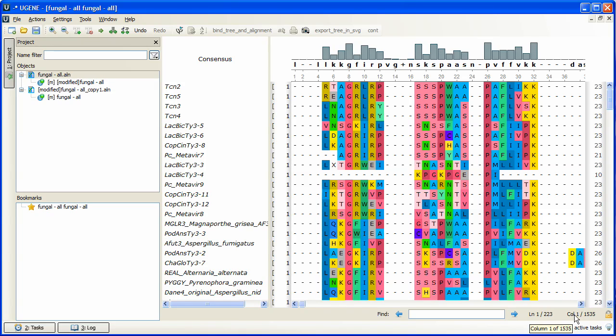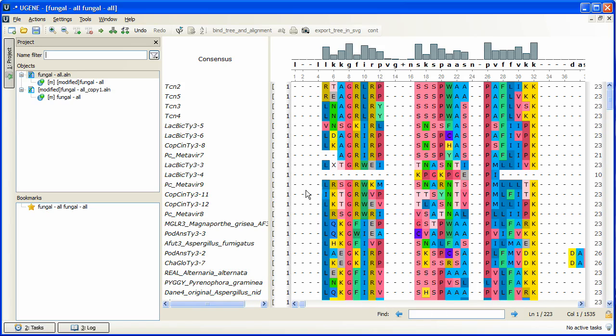Muscle works well with alignments consisting of up to one hundred thousand sequences in UGENE. But if we need to work with even more sequences, then we have a special solution – the K-Align tool. Let's apply it to the saved copy of the alignment.